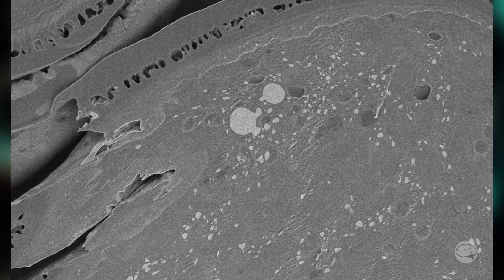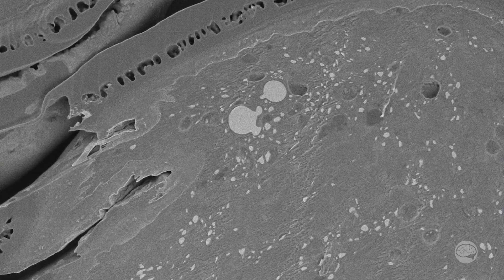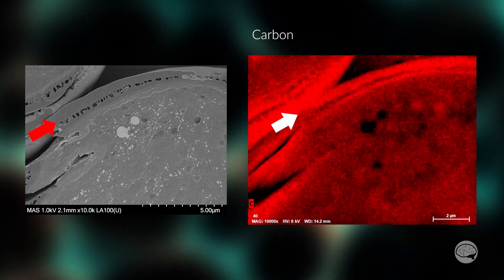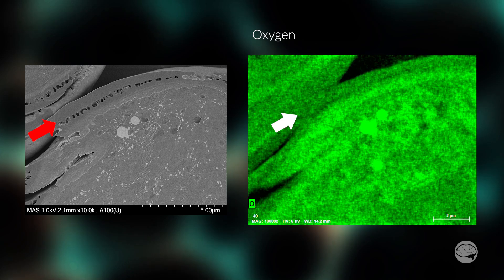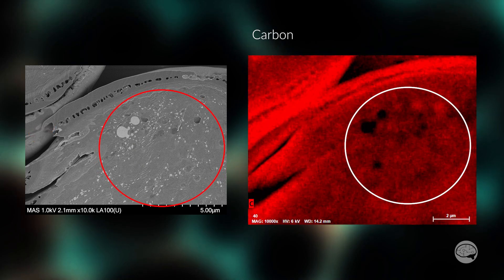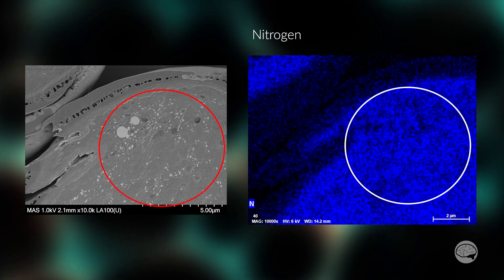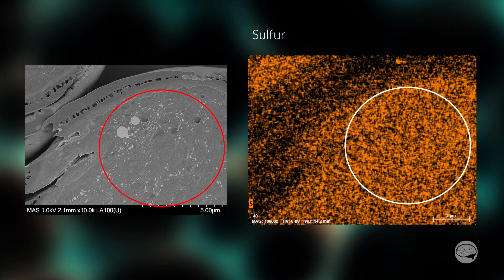So the EDS maps I'll get out of this will tell us qualitatively not only what elements are present, but where in the sample they're present. We can see that the hard outer coating is basically just carbon with a bit of oxygen — that surprises me in no wise. In the bulk inner part of the sample, there is a little bit of carbon as we would expect, but it also has a lot of oxygen, nitrogen, and sulfur.